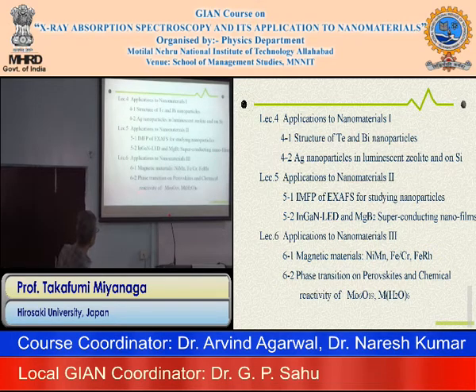And the last one, I showed you the perovskite structures. This is the structural phase transition. This is also a long-studied, famous material. But from the local structure, there is a difference between the XAFS and XRD, X-ray diffraction. And the chemical reactivity of this type of simple material.